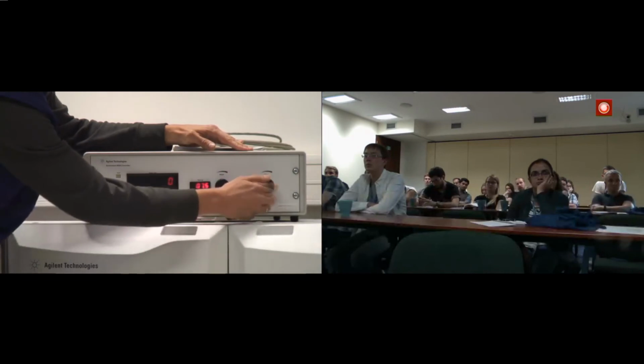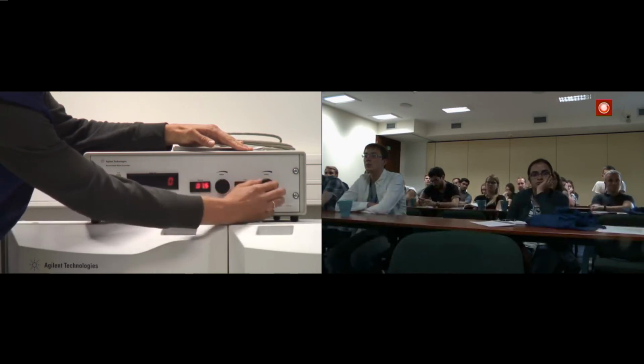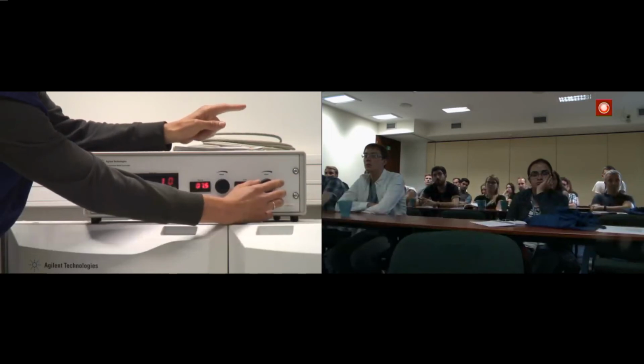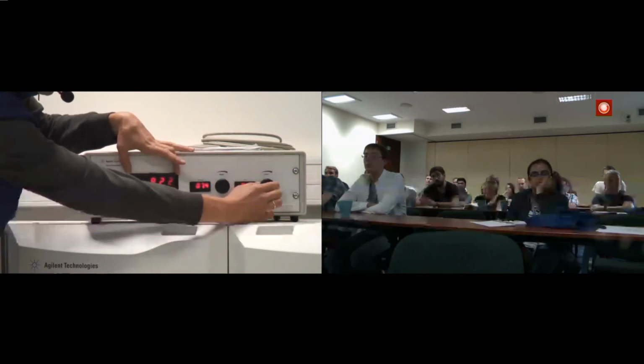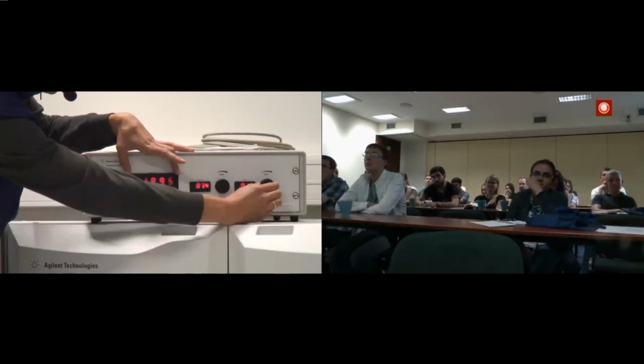And then I would like to introduce drive pressure using those knobs here. I would like to gently increase this drive pressure, aiming directly at our propeller now. And over here at this display, you can see how the frequency of rotor rotation increases gradually with an increase of drive pressure.